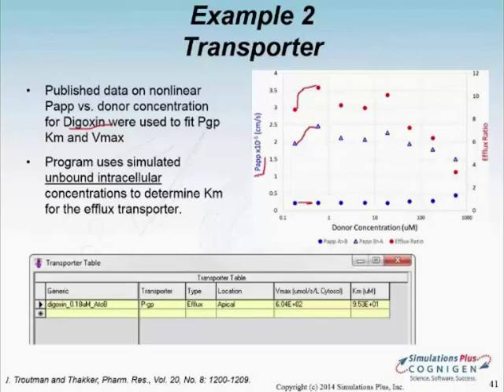And then there seems like there's a clarifying comment, not inside the cells, but on the membrane, metabolism by the membrane binding enzyme. No, we have not incorporated that kind of process, which would be taking into account the concentration in the membrane. No, we have not dealt with that process yet. Okay.